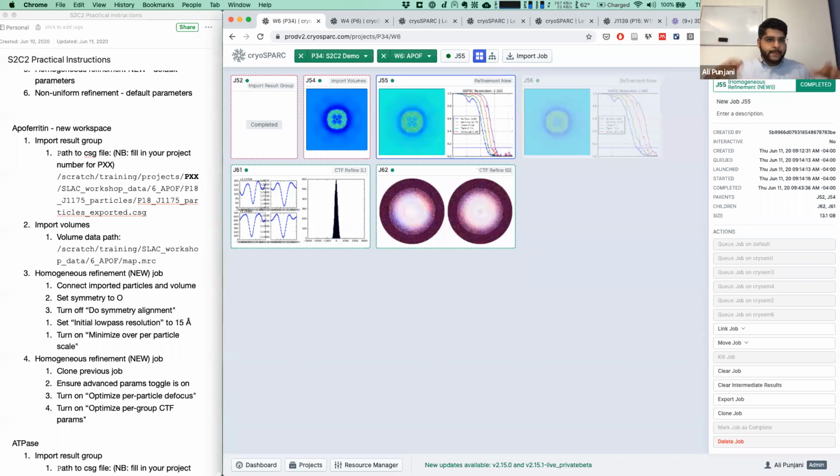When you have a large particle, there's lots of signal. You can easily detect the difference between a particle that has a defocus of 10,000 angstroms versus 10,001 angstroms. Maybe not that precisely, but you can easily tell the difference between a particle that's moving a little bit up and down within the ice if it's large and rigid. If it's small and your ice is thick, then there's not really much hope. However, with small particles in thin ice, it is still possible to get an improvement from CTF refinement, because the thinner the ice, the better the signal to noise ratio will be.